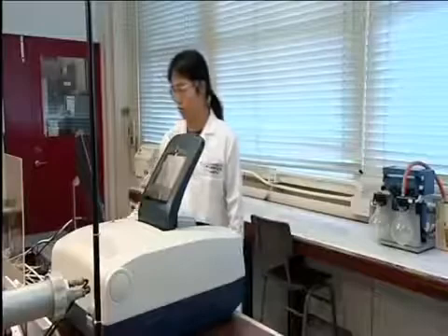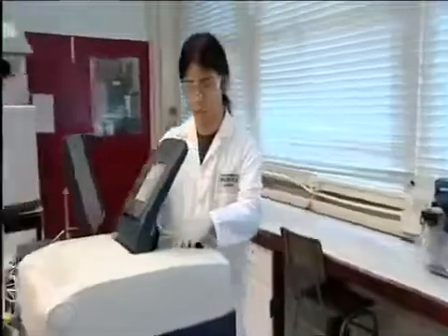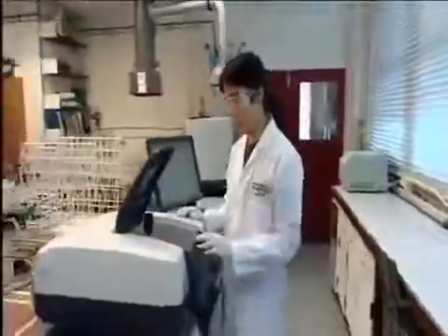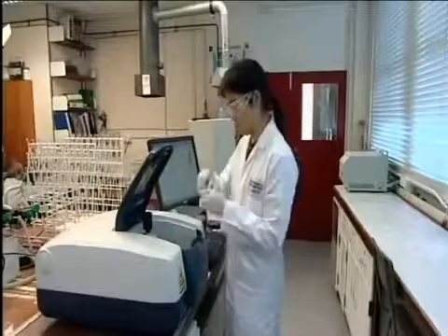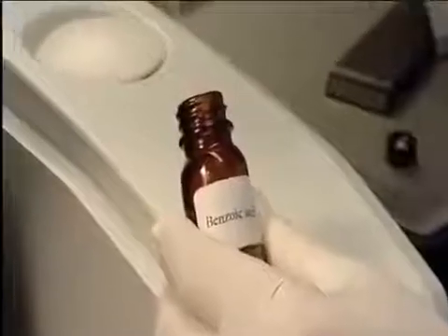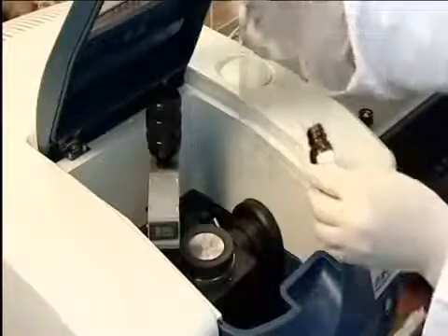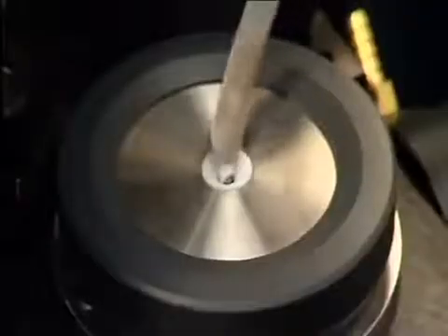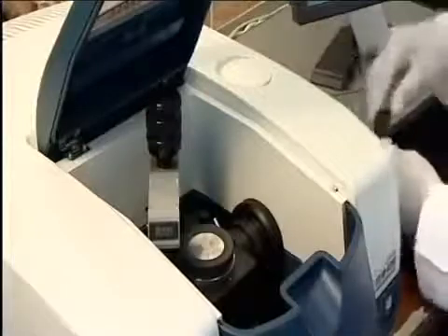Here, we will run the IR spectrum of solid benzoic acid. The instrument is switched on, and a blank is run with no sample in place. This is to find the absorption of the air, which must be subtracted from that of the sample. A little benzoic acid is placed on the ATR crystal. This is a holder for solid samples. Less than 1 milligram of solid sample is required.